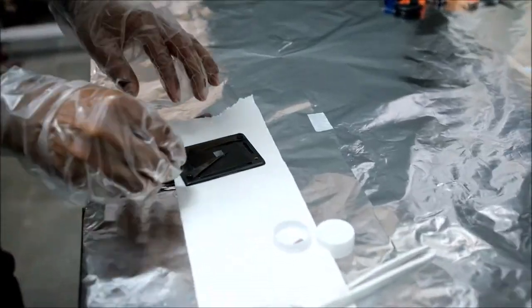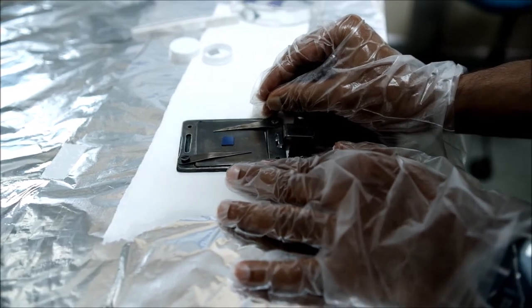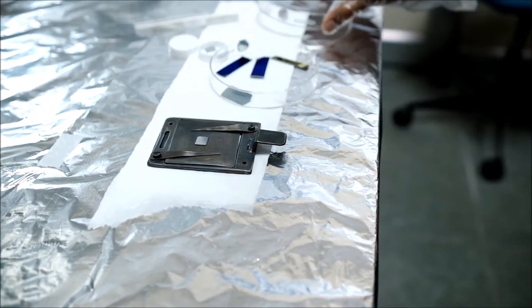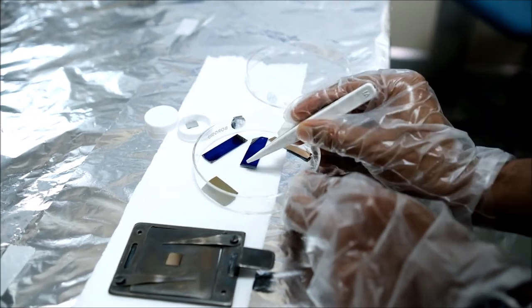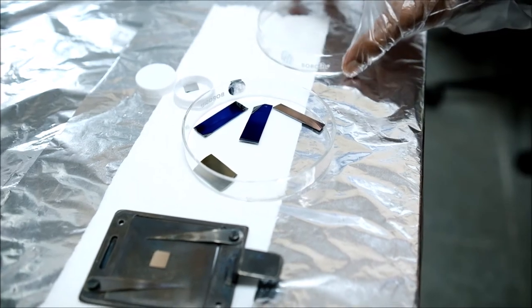The temperature is below 50°C so we can take out the substrate. We close the nitrogen valve and open the chamber door. We see our deposition — we expect a contrast between the bottom of the clip and the other parts. It is a very thin film and with the naked eye a clear contrast can be seen. On larger substrates, the area covered by two clips shows no deposition while the exposed area shows a blue-colored film. This concludes the demonstration — I hope this helps you become familiar with the RF sputtering system.